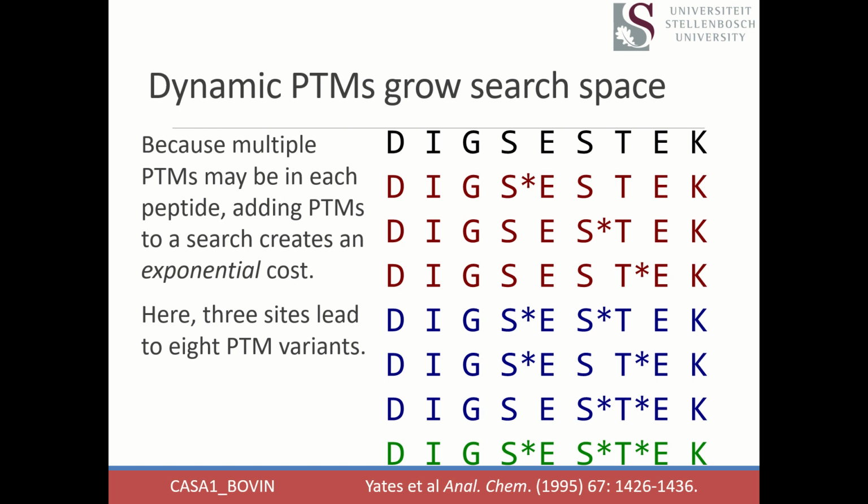Okay. Now, I mentioned that we need to consider the possibility that a residue, an amino acid, may be present in unmodified and modified form if we're looking for PTMs. We can think of this as the one that we always include, right? Oxidation of methionine. We look for oxidation of methionine because methionine, you manipulate your protein in the tube on the bench. You look at it wrong and suddenly it's oxidized, right? So we need to consider the possibility that methionine may be in its normal form or it might be in an oxidized form.